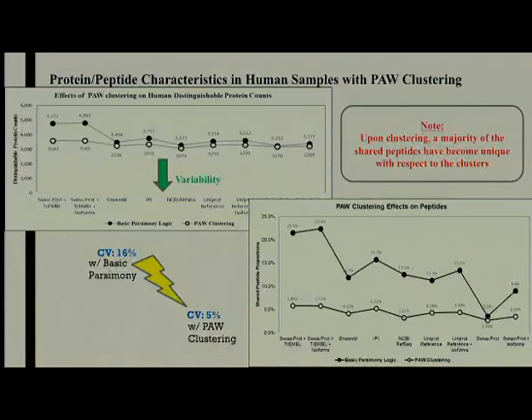Did you look at the effect of unique peptide count, as far as how many unique peptides were required to identify a particular protein? Sorry, how many unique peptides did you require in order to identify a protein in the protein entries process? Well, one of the parsimony principles is a two-peptide match. So in order to identify a protein, you should have at least two distinct peptides. So that was the minimum criterion. So all your data was generated with the two-peptide rule? Yes, and also the subsets are complicated. Two distinct peptides, and they won't necessarily have to be unique.